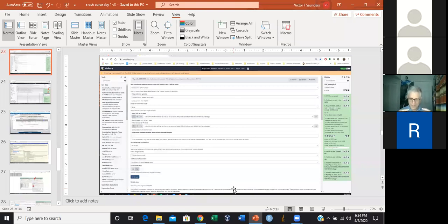And the way that it's done is by reducing the size of the thing by putting the sequences in little buckets. And then you say, well, of this bucket, I'm going to take some of the pieces out and say that this one is part of this class of genes that's in this location. And the one over here is probably going to be from that one because it has this sort of ratio of nucleotide bases in it. And you start going through and then you find out what the probability of it being any particular one is until you come to some sort of consensus.